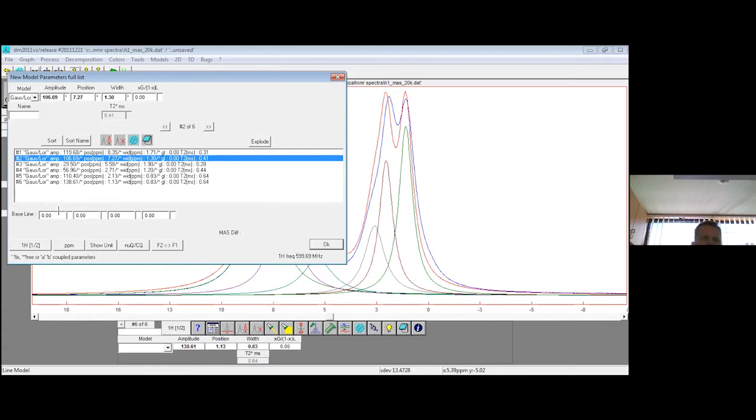If I had a bad baseline, I could also use it to fit a simple displacement or a straight line or a parabola or a third order polynomial, if all four parameters were marked as the parameters that are changed during the fitting. In this particular case, we don't need that.